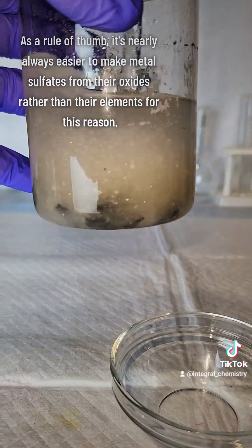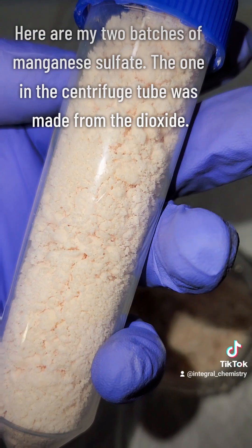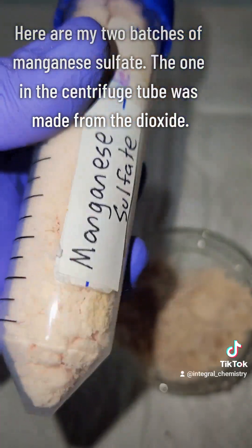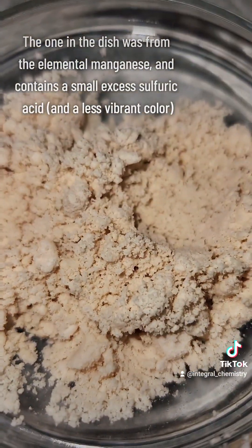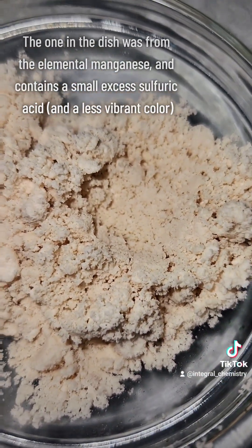I definitely don't recommend trying to make a metal sulfate from the metal itself. Here are the final products from both methods — the better one is in the centrifuge tube and the other is in this dish. I hope you enjoyed this process, and if you'd like to see more science, consider giving me a follow.